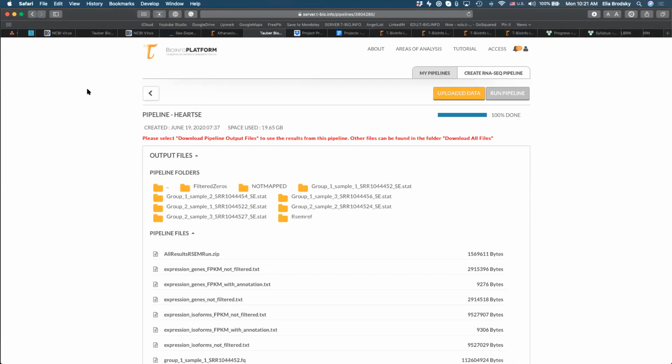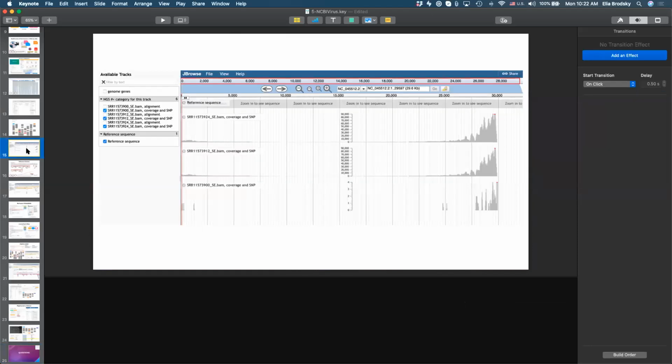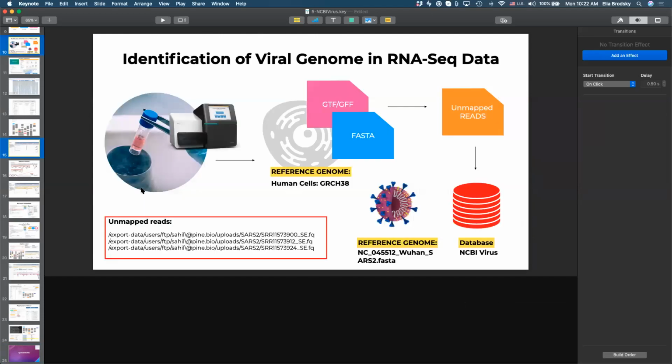Okay, so a good question. Sravia Angara is asking, how can we extract the HTTPS of the SRR samples from the NCBI website? Okay, so we don't generally allow you to just start analyzing a bunch of data by uploading large data sets. You do have the ability to analyze public domain data sets, however, and we gave a few examples of projects where we provide you with specific data sets that you can practice with, right? So for example, we talked about uploaded data sets, which are FASTQ data, right?